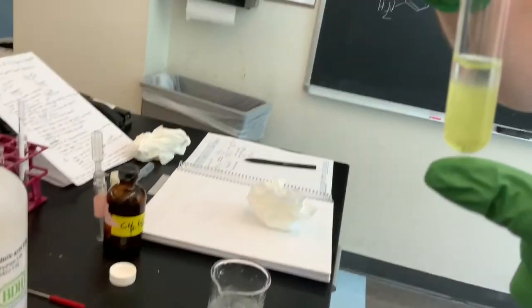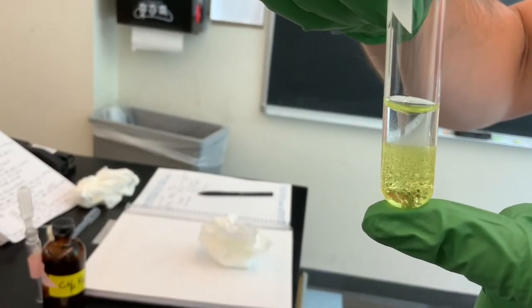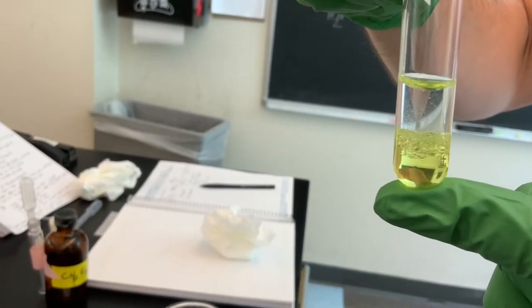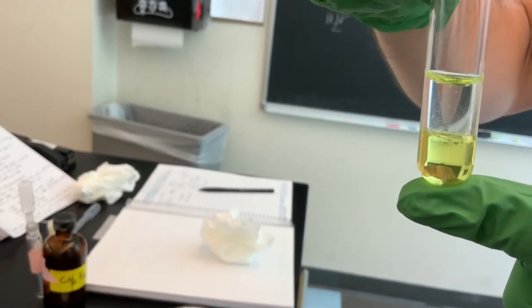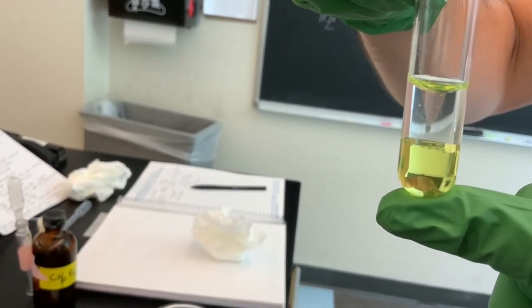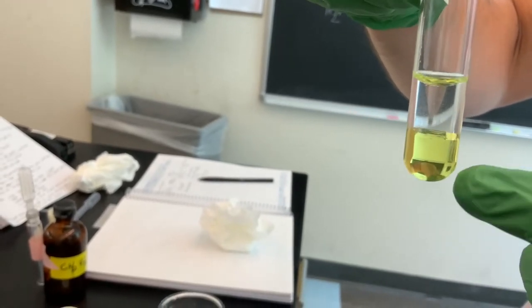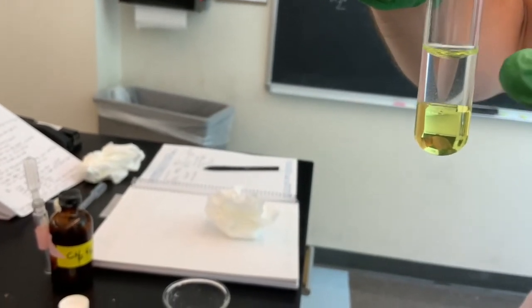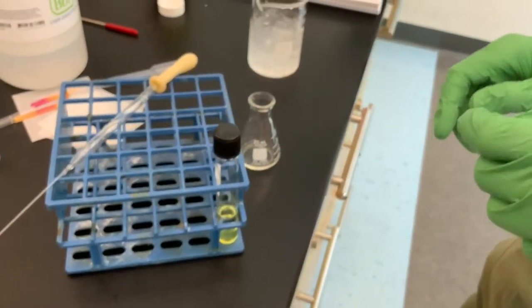And so you see that they're separating. It's kind of cool to watch. So now the bottom organic layer, the methylene chloride, has all of the 9-fluorenone, and the top aqueous basic layer should have any remaining sodium benzoate, right? There should be no benzoic acid here because we've deprotonated it all, and it's much more water soluble, right? We even calculated the partition coefficient for it.